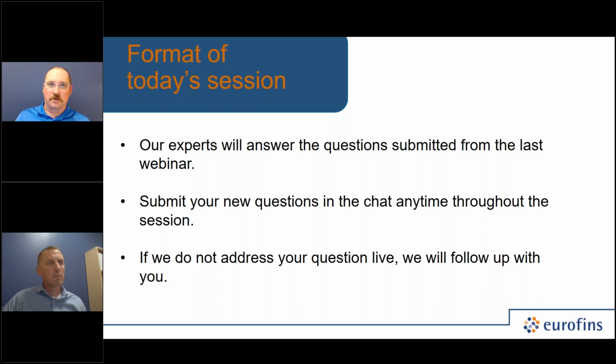I mean, there's the notion that all clinical trials were done in CFU, and so it's going to be impossible to use flow cytometry because of AFU, and there's no correlation. But actually, it's not entirely accurate, just because there are a lot of clinical studies out there that used a different unit of measure altogether, or didn't state explicitly the dosage format in CFU, for example. And so that argument kind of becomes a little bit muddied. But really, it comes down to substantiation.